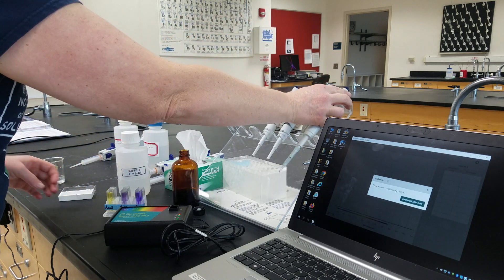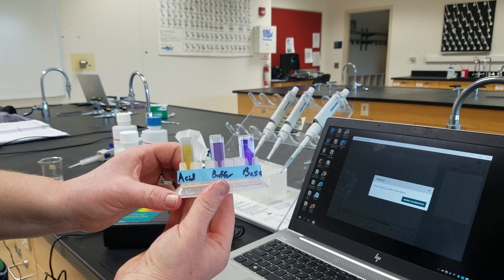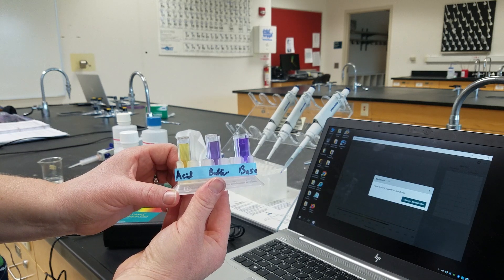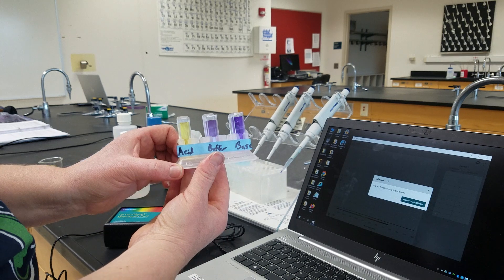It is important that you record the colors of your acid, your buffer, and your base, because you're going to be using these colors in order to determine what your unknown indicator is.